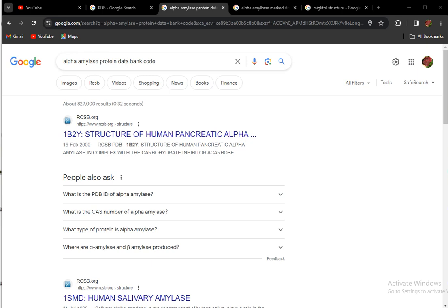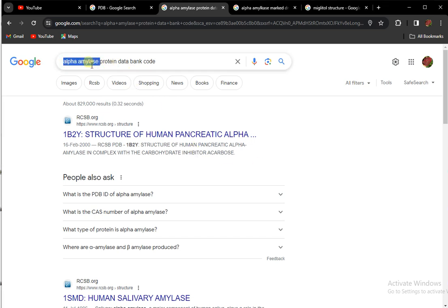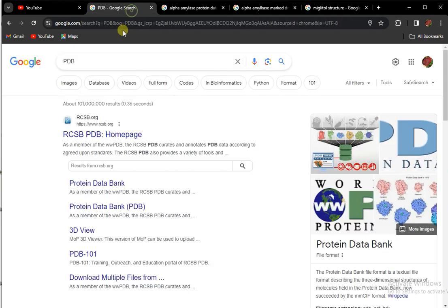Assalamu alaikum, welcome back to another exciting video. In this video we will learn how to work on AutoDock Vina. For the first step, my protein is alpha amylase. I have to search for alpha amylase protein data bank code. Here it is showing this code; I simply copy this and paste.